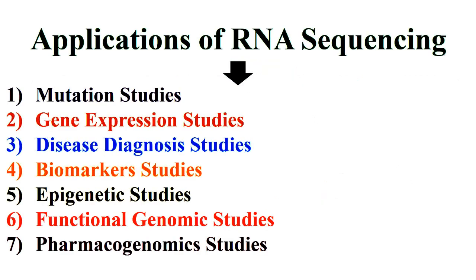Therefore, RNA sequencing is used in mutation, gene expression, disease diagnosis, biomarker, epigenetic, functional genomic, and pharmacogenomics studies.